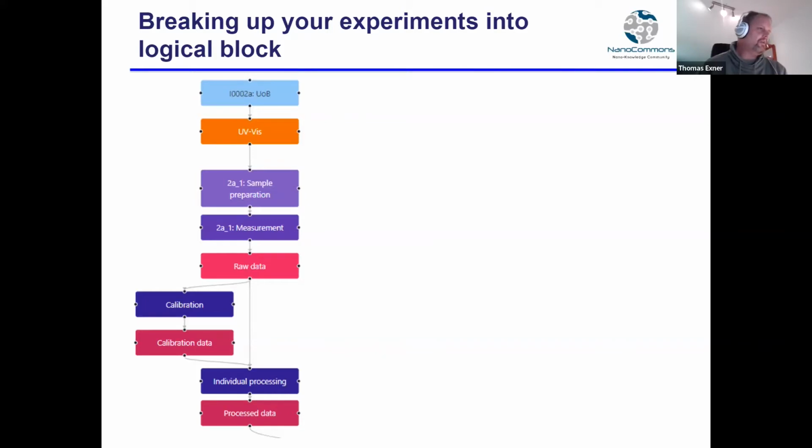The main point is, first, you can always directly link the data to it. And when I say data, I mean that very generally. A protocol is for me also some kind of data. I can also call it information, but whenever I say data, I more or less mean everything you find here: raw data, process data, but also protocols and even more.